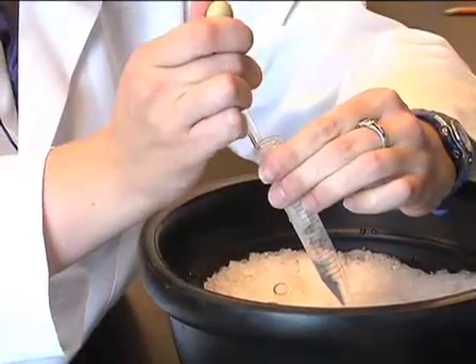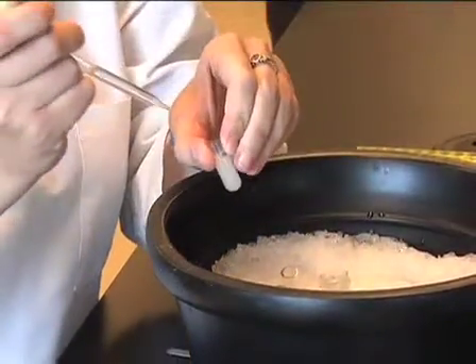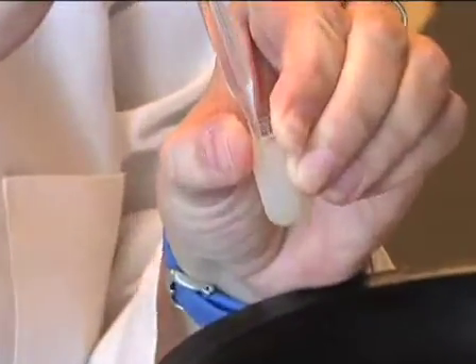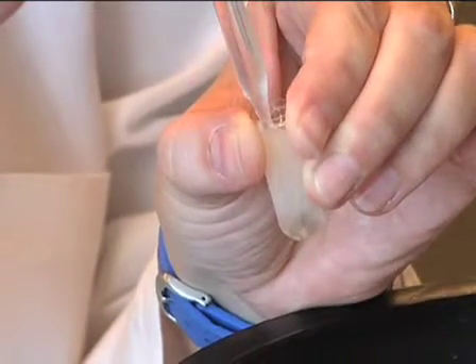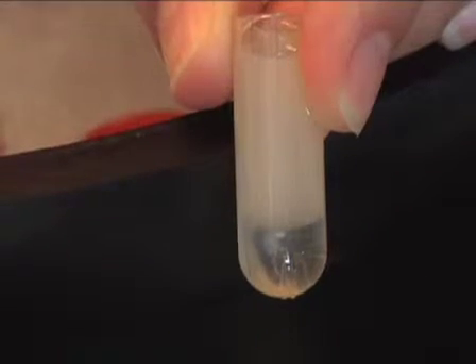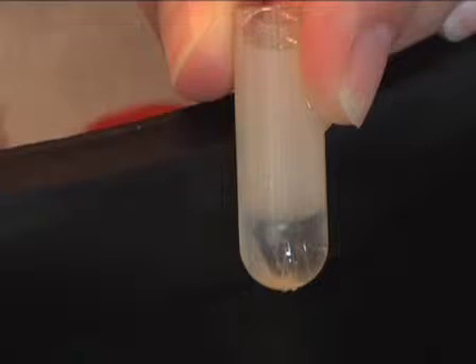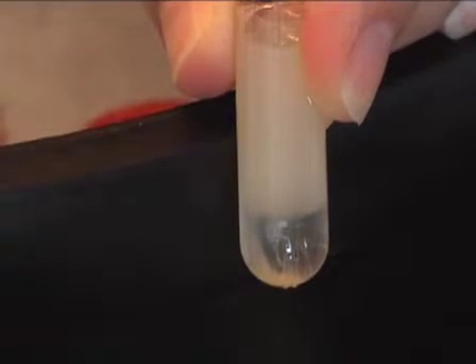Then underlay the membranes with 2x sucrose egg lysis buffer by releasing it from a Pasteur pipette at the bottom of the membrane-containing tube. Add enough buffer to fill the tube — a clear layer will easily be seen below the membranes. The 2x sucrose egg lysis buffer acts as a cushion to remove any proteins peripherally or non-specifically associated with the membranes.